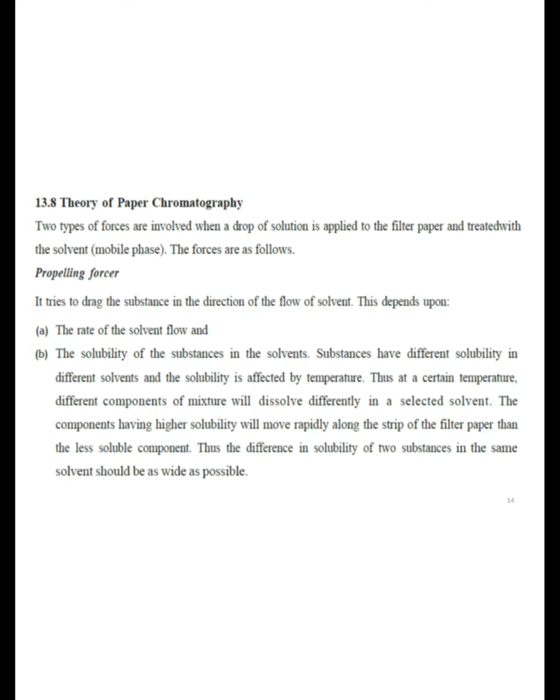While you are spotting the point of the solute or the given mixture, the mobile phase makes the solute elute upwards. That takes place in paper chromatography.